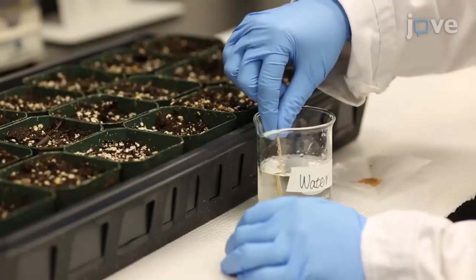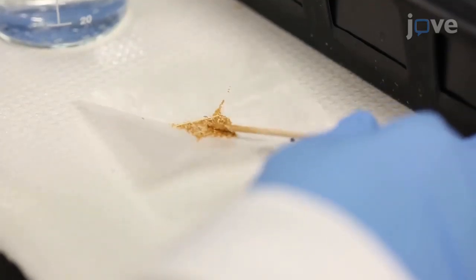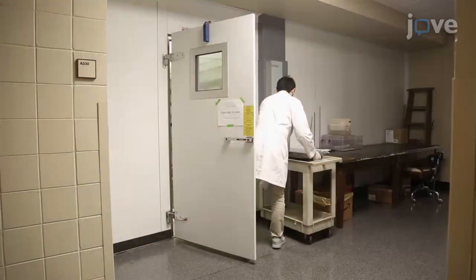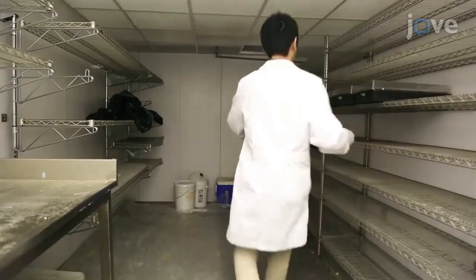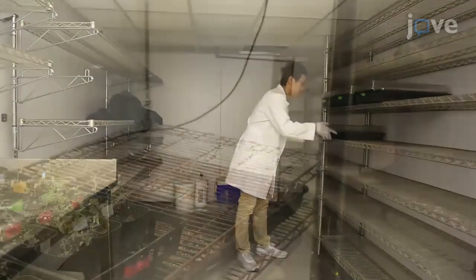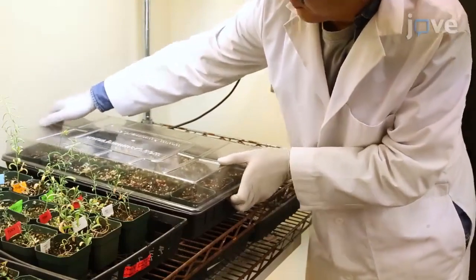To begin, use a wet toothpick to transfer about 20 to 25 S. parvula seeds onto wet soil. Then stratify the seeds at 4 degrees Celsius for 5 to 7 days. After stratification, return the seeds to the growth chamber for 7 to 10 days.